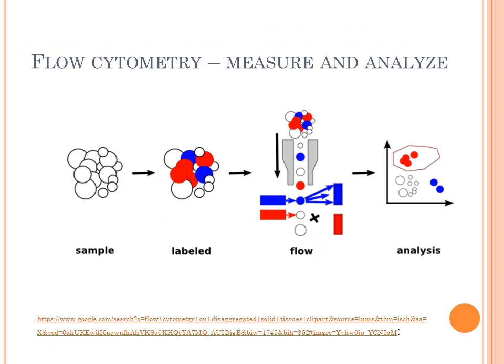And then after processing, here's our processed specimen, whatever it might be. We have added those labeled antibodies, allowed time to elapse, and then this mixture of cells that's in a fluid environment is drawn single file through this device, and there'll be an aperture.